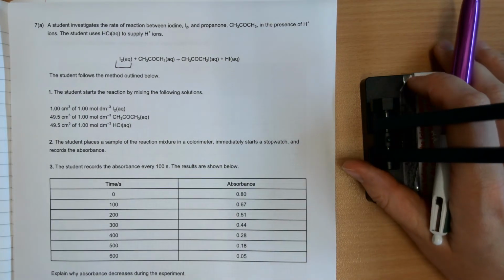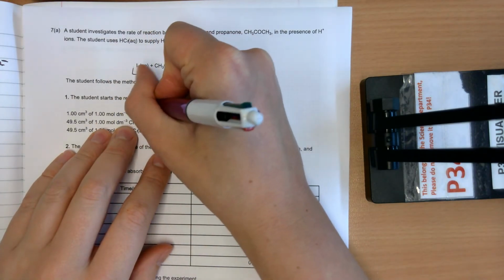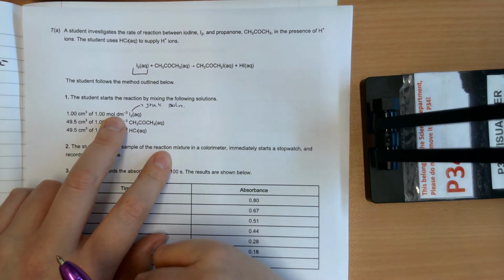I think a lot of you in this case would just take that value and plug it straight into the table, and that wouldn't be correct. Okay, this is your stock solution. This is what you made up in your little volumetric flask. Your stock solution in your volumetric flask, you made it up to 1 mole per decimetre cubed.